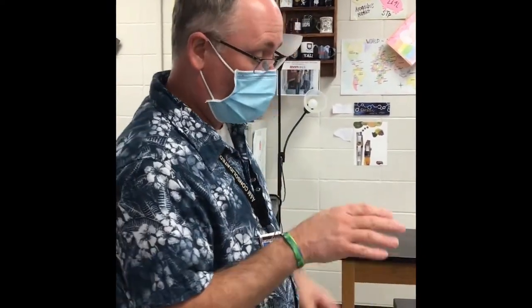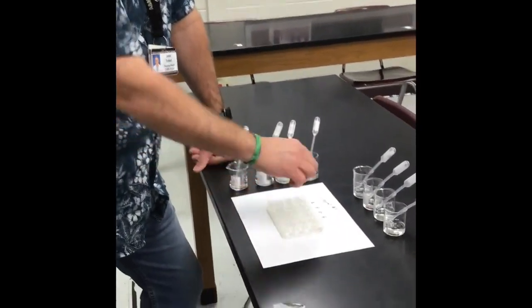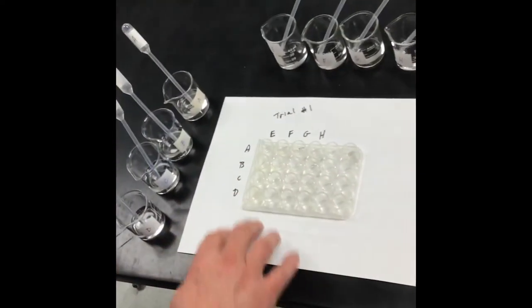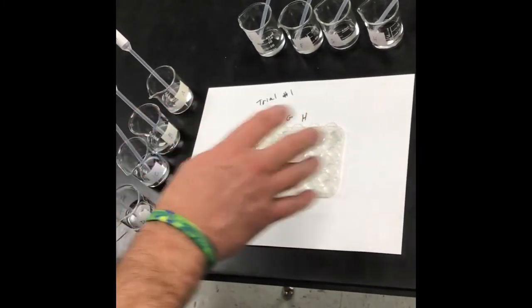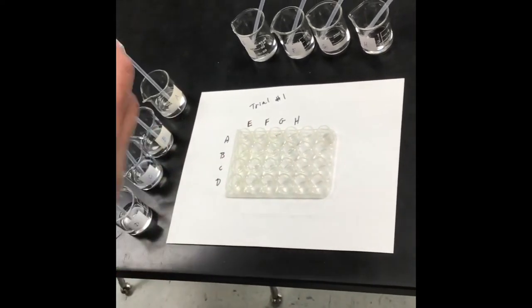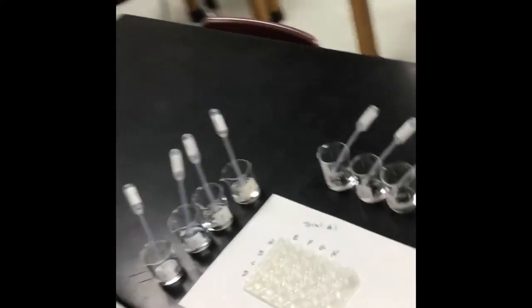What I'm going to do first is I already have this set up with 10 drops of each of the E, F, G, and H in each of these 4 going down. I've added 10 drops in each of these. What I'm going to do then is take each of these and add across here in sections of 10 drops, and we'll see what happens as a result of that. And then we'll do the exact same thing for the other 2 trials.